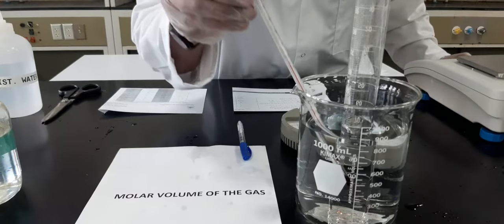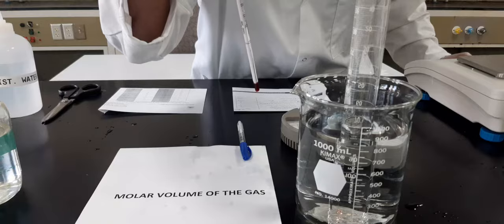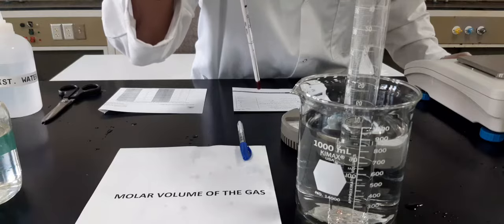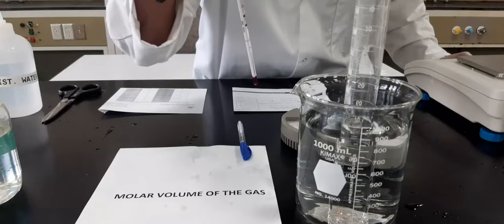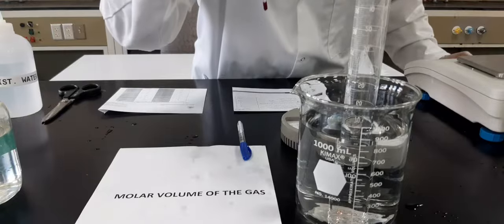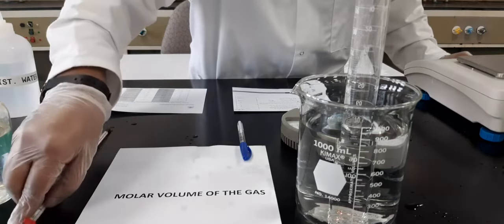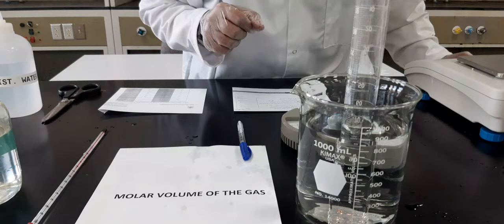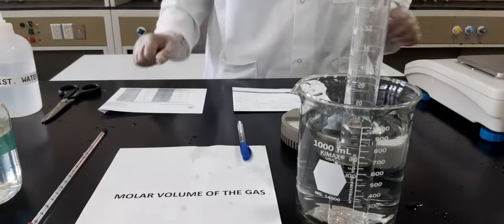Firstly, the thermometer: you will take it out and take a close look. What is the value on the thermometer? This thermometer is in Celsius, and you are required to write the unit in Kelvin. So remember, whatever you see in Celsius here, you will add 273 to it. So it says 24 Celsius for me. Now you will add 24 plus 273, and whatever the value is, you will write it down in Kelvin.